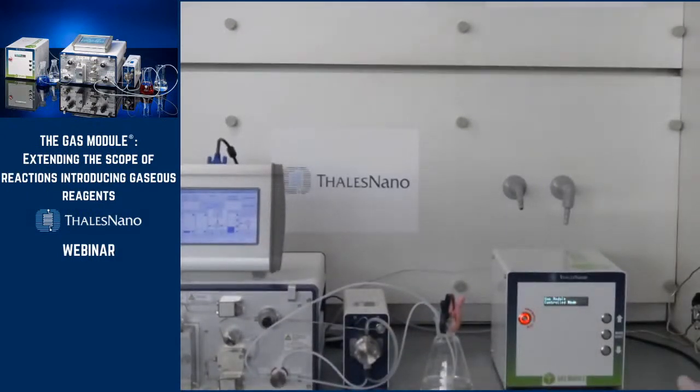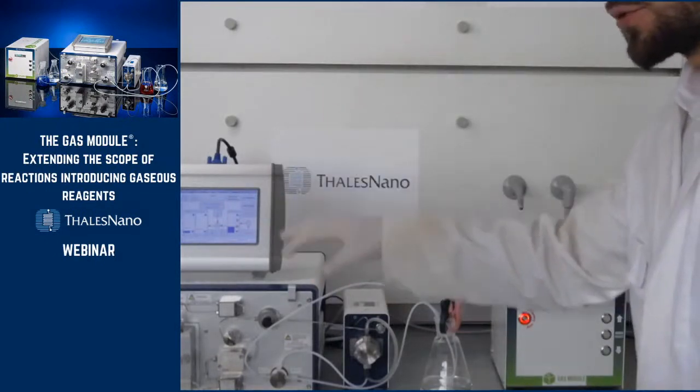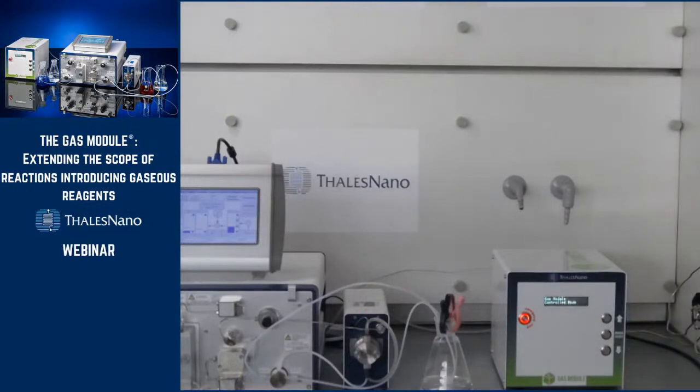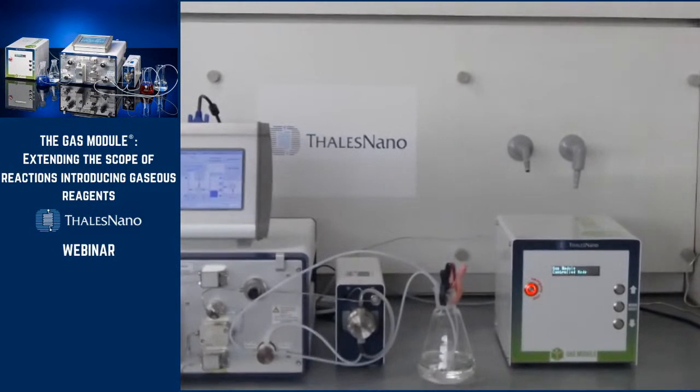Now, the same way we went through the liquid line, I'm going to go through the gas line. It starts with a cylinder. You cannot see it here as it is outside the field of the camera, but you have to have a cylinder in order to connect it to the gas module and inject your gas.